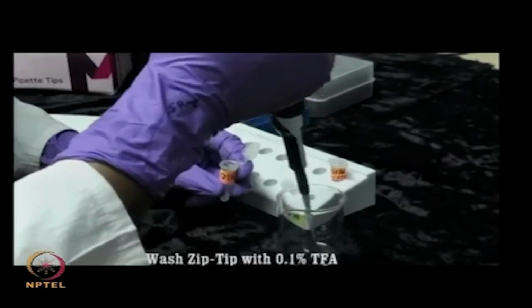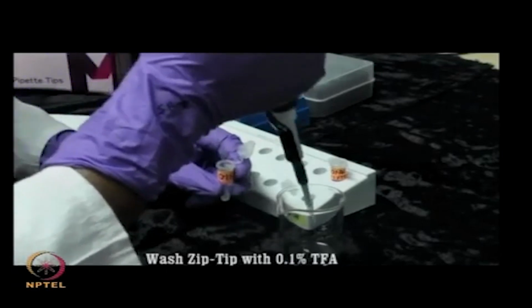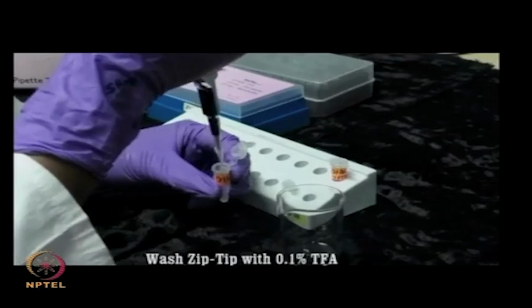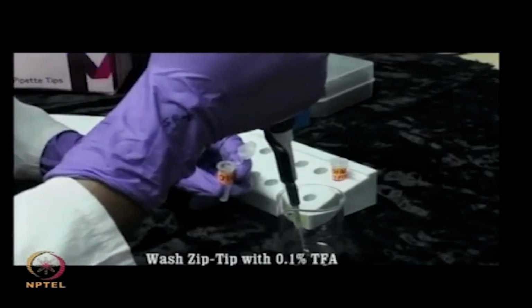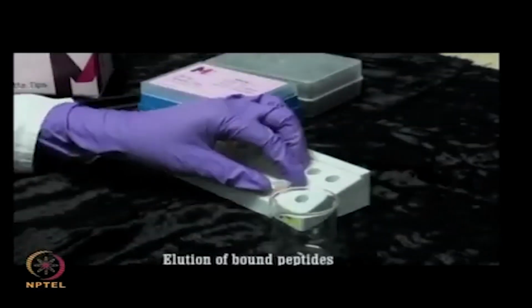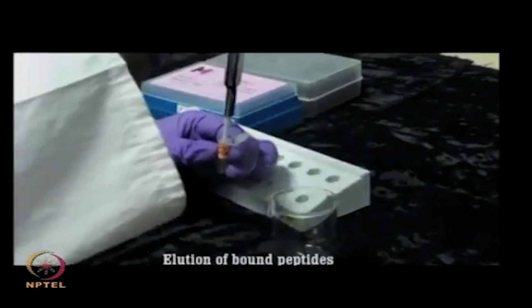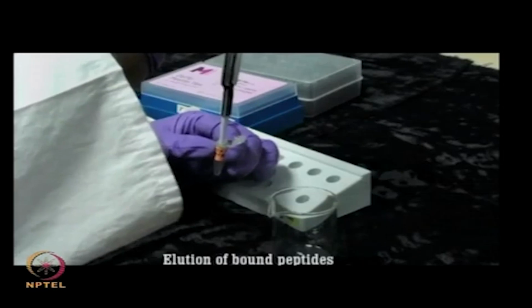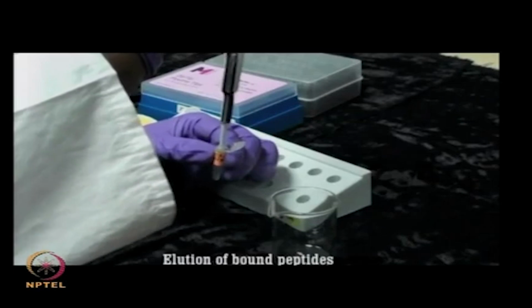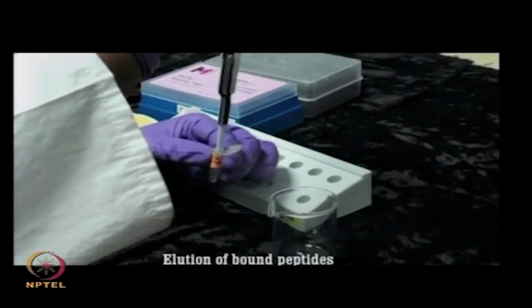So, samples are passed through the activated ZipTip, where they are captured in a bed of chromatography media. Now, wash this C18 tip thrice with 10 microliters of 0.1% TFA to remove the salt and other interfering components. These steps ensure the salts and detergents are washed away, and finally, samples can be eluted in a very small volume of solvent.